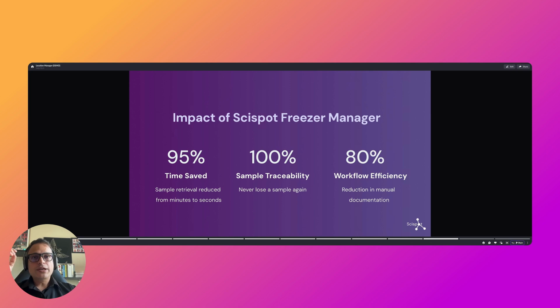It would not only generate those, but it would suggest what dimensions make sense for my lab. It would also suggest where I should be storing them, and then it would flag you as you're nearing the 80%, or as you're filling those shelves and racks and boxes with those samples.